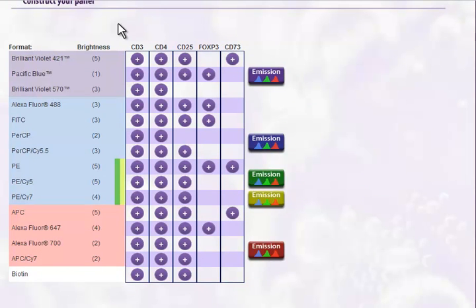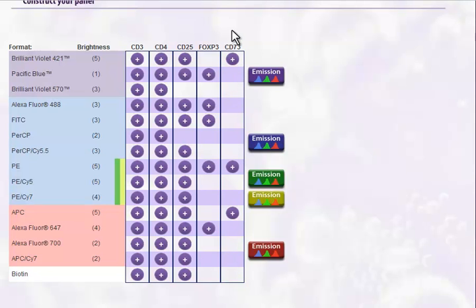Now, let's start adding products to our panel. We would recommend starting with the specificity with the least formats available. This makes panel selection much easier. As you get to the end, you will have more options. In this case, CD73 has the least formats available, so let's choose a format for CD73 first. Let's choose PE.